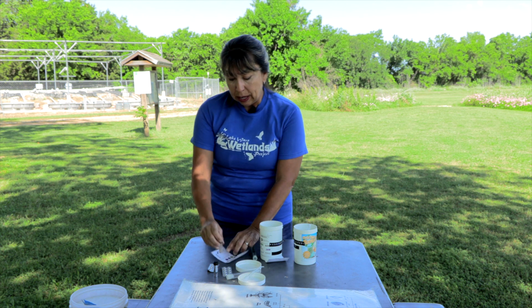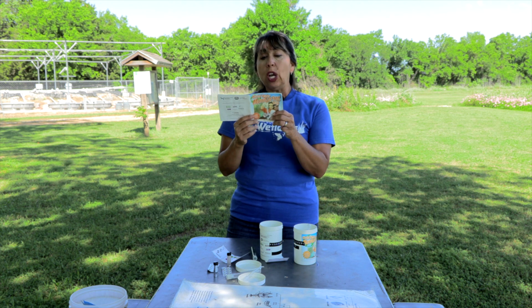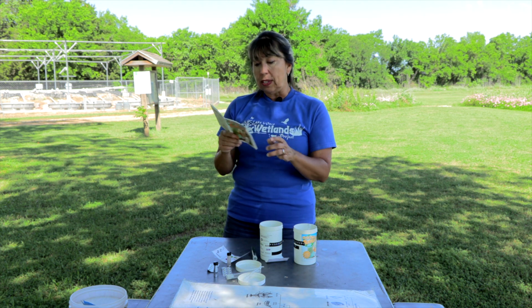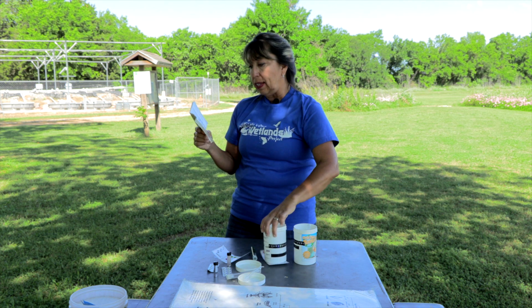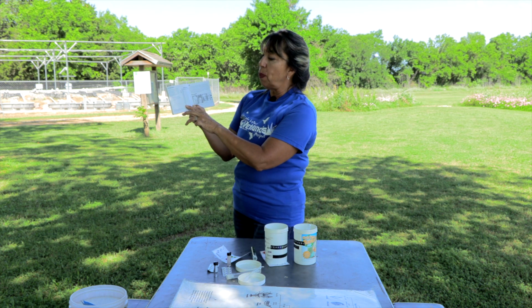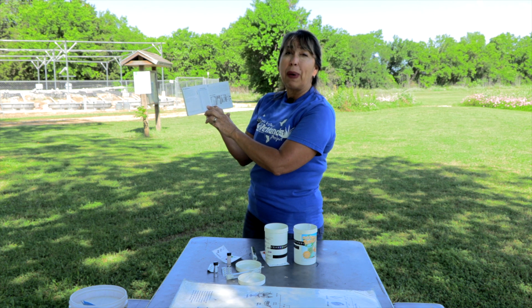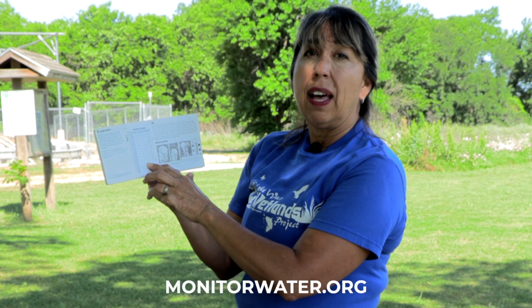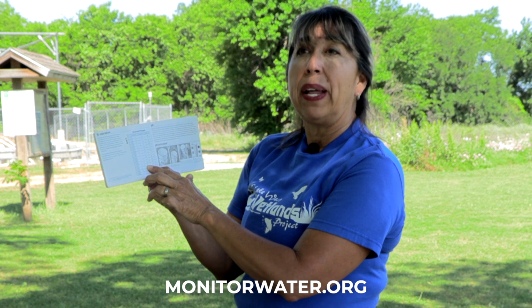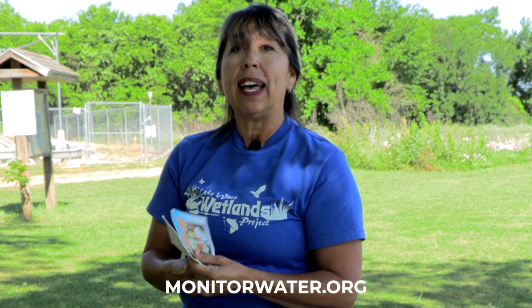So now, through the World Water Monitoring booklet, we're going to measure the saturation. We said our temperature was about 24 degrees Celsius. On this chart, we go down, and we said that our dissolved oxygen was about 4 parts per million. According to this chart, we have 48% saturation of water molecules in the water right now. So right now it's telling me it's a healthy environment.